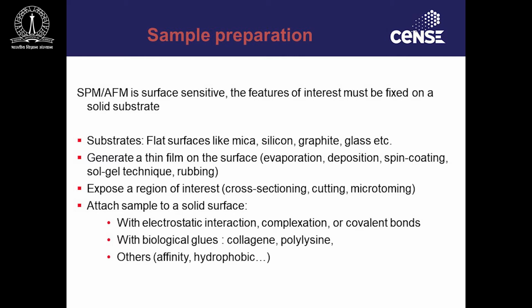But the thing to be taken care of is, if you are doing AFM in air, that is the most general technique, the sample, whatever we prepare, should be completely dry. There shouldn't be any moisture on it, or else what can happen is we can have this problem of capillary effect, which can affect the imaging, and we will not get any good images.